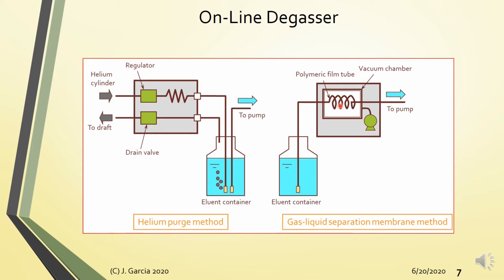Now, some other practices, no, to really reduce the amount of dissolved gases would be to sonicate your mobile phase. So after preparing your mobile phase, kunwari mixture ito, after filtering, no, so prior to use, diba, normally we sonicate the resulting solution for around 15 minutes siguro, no, in a sonicator with a little bit of ice to prevent heating, no? And this will help the removal of dissolved gases.